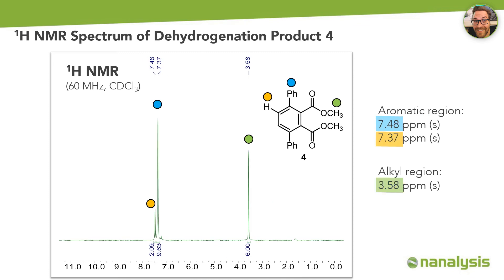After confirming the outcome of every single step of the presented synthesis, the final dehydrogenation product shows a very clean NMR spectrum with two singlets in the aromatic region at 7.48 and 7.37 ppm, and a singlet in the alkyl region at 3.58 ppm, which can again be assigned to the methyl groups in the molecule.